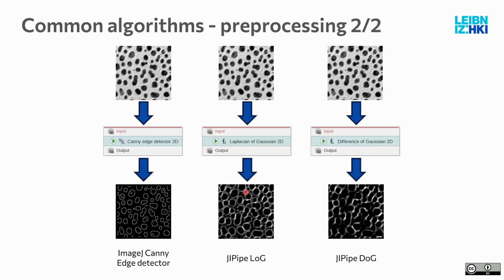Just be careful that this one will make a 32-bit image because it can go into the negative space. One of the exercise pipelines that I provide you actually does the necessary conversion, where it basically takes only the positive part. But it is explained in there, so if you choose to use this example.